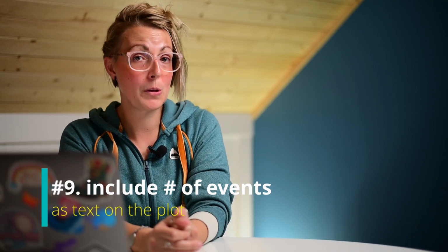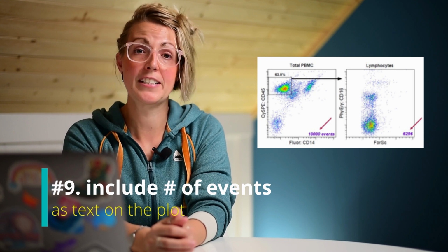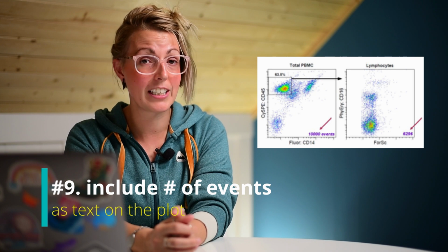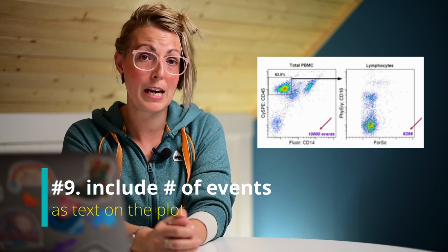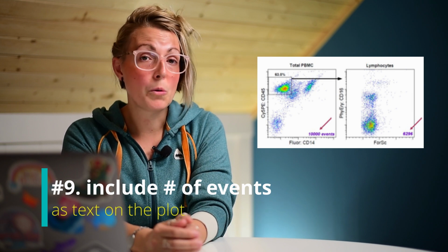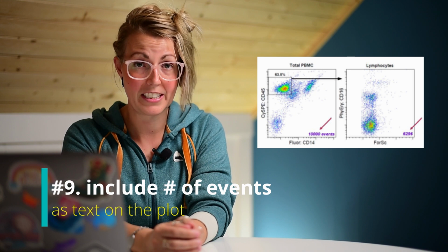Tip number 9, include the number of events somewhere on the plot. This is especially important if you're using a contour plot. With dot plots, readers can have a fairly good idea of how many events may be on that plot, but with contour plots it's pretty difficult to assess. Knowing this number will really aid them in interpreting the data and also understanding the precision of the analysis.